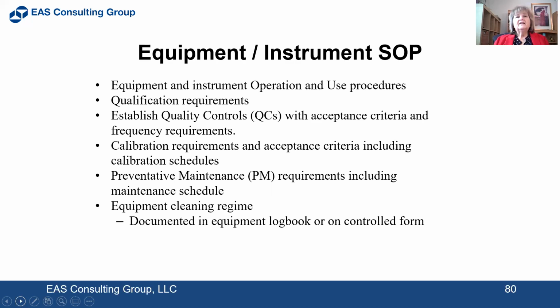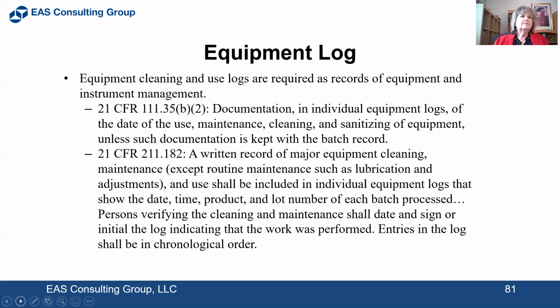And you need to have a cleaning regime and have that documented either in the logbook or on a controlled form. Equipment cleaning and use logs are required as records of equipment and instrument management. And here are the regulations for 111 and 211.